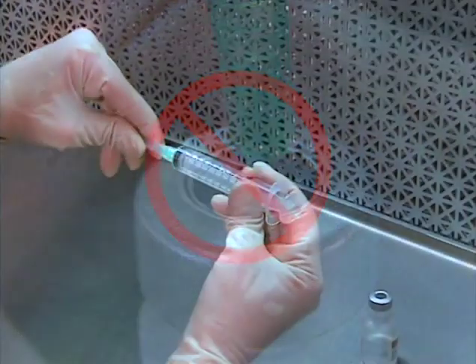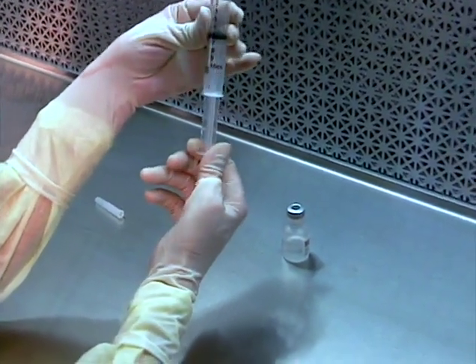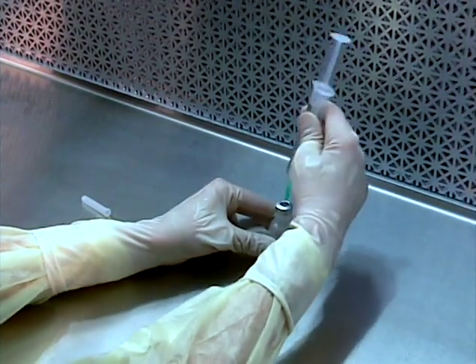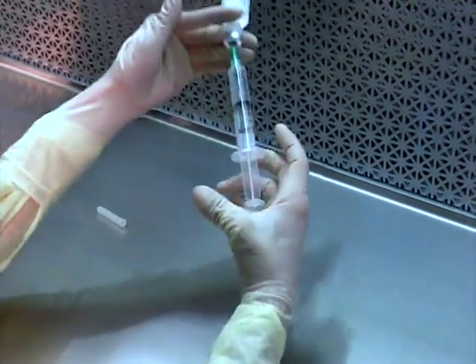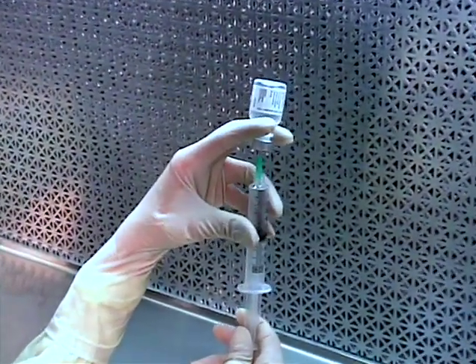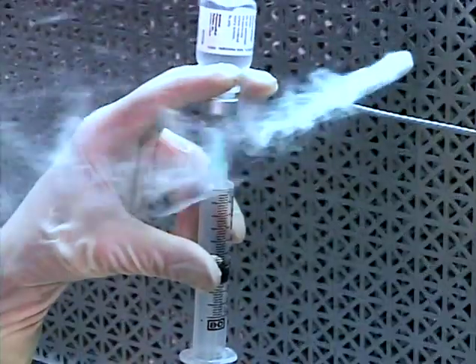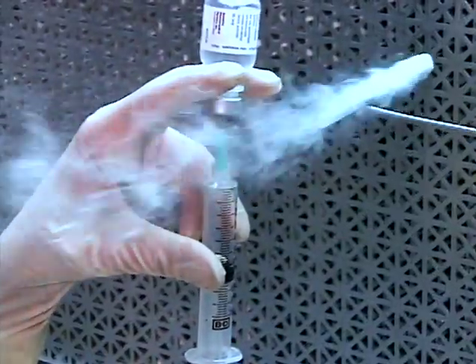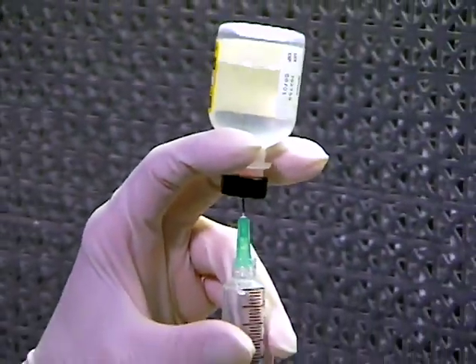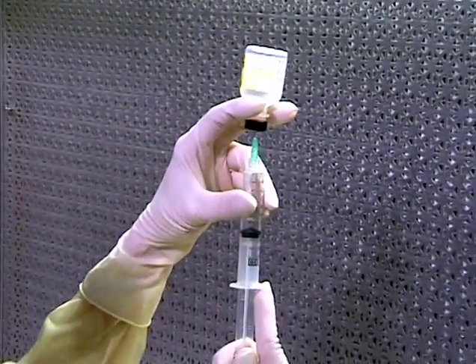Grasp the vial and syringe so that the fingers are not near the septum needle critical junction, and invert the assembly, maintaining the flow of first air across the critical site. Do not block the flow of first air. You may use a V-grip or any other secure grip suited to the container and your hand that maintains the flow of first air to the critical junction. The V-grip is accomplished by wedging the inverted vial between the slightly bent index and middle fingers at the neck and using the remaining fingers to grasp the syringe barrel. This leaves the other hand completely free to manipulate the plunger.